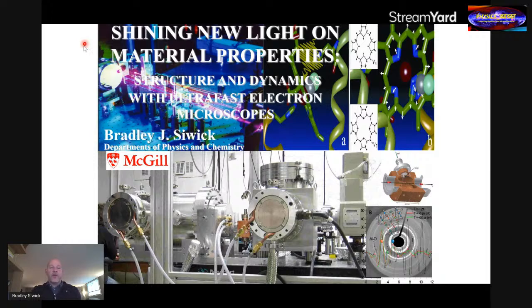So what kind of physics are we talking about today? We're talking about materials physics, all of the physics that happens inside of materials, and on the experimental end, I'm going to talk to you about very new experimental techniques, some very new instruments that in part were developed and designed by my research group at McGill, but there's a wide community of researchers in this area now, and there's a very exciting ferment. Lots of very rapid progress, lots of very exciting things are happening in this field, and I hope to communicate some of that to you today. So the subtitle is Structure and Dynamics with Ultrafast Electron Microscopes.